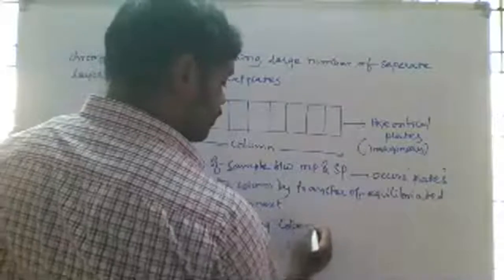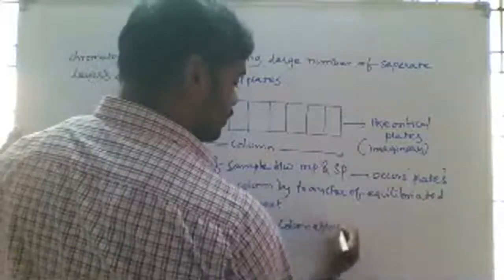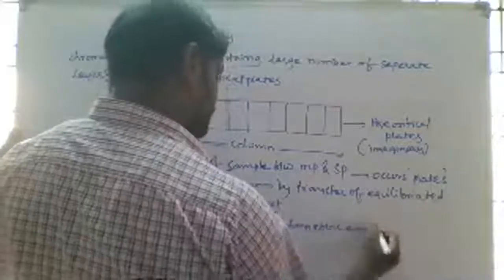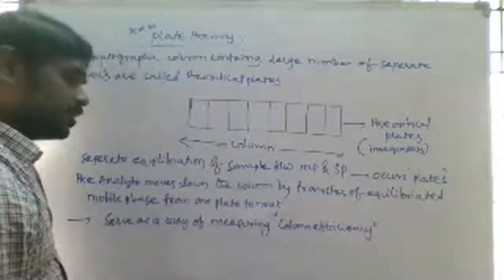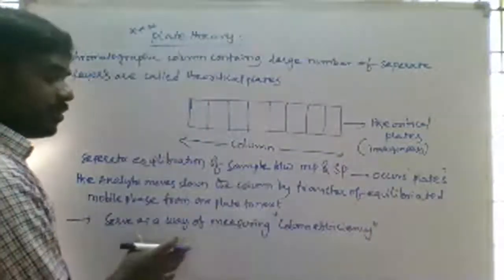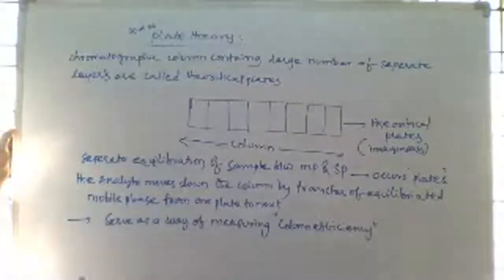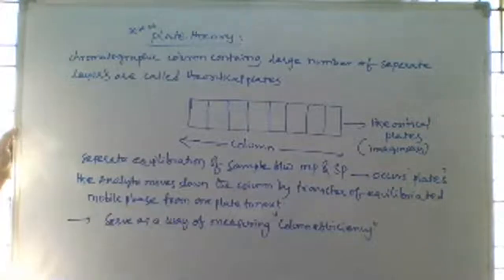The theoretical plates serve as a measure of column efficiency.